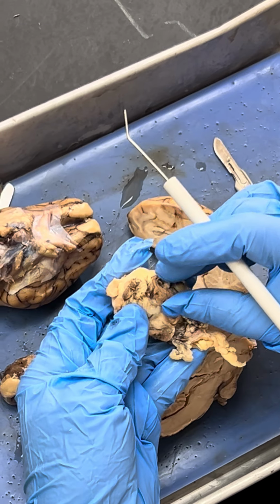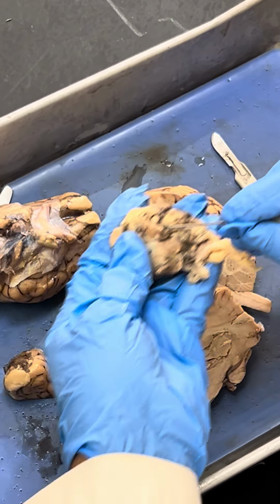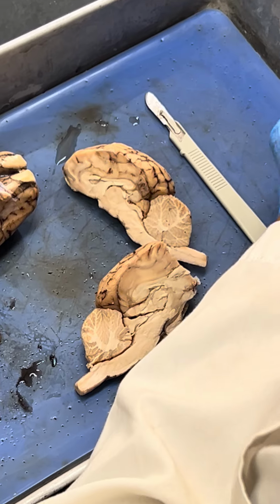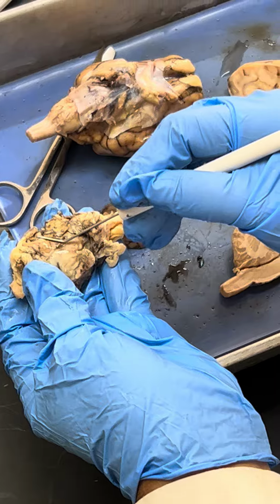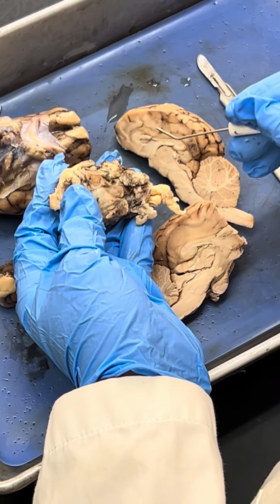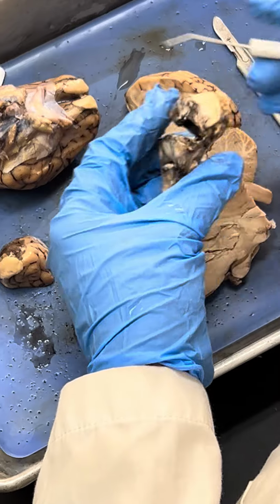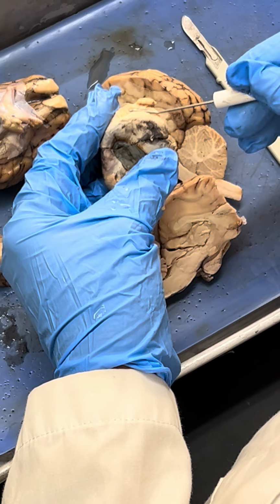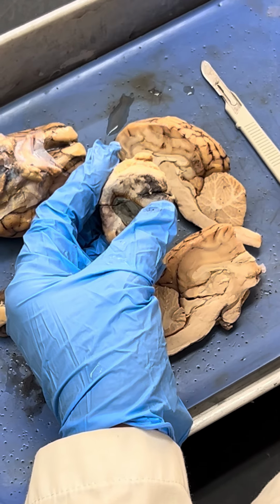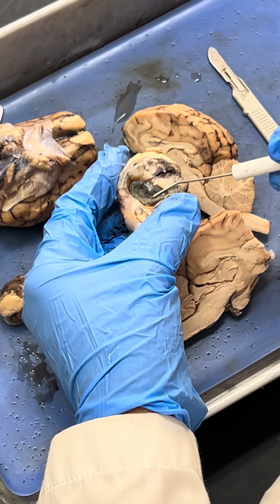Now the eye, sheep eye. If you go behind, you will feel there's a hard structure here. Can you see this one? I don't know. All of you, very hard. This is the optic nerve. Optic, open sheep eye. Which page? 150. Optic nerve. This white outer portion is known as sclera. The covering of the sclera is conjunctiva. These are all questions, okay? And this transparent part is the cornea.